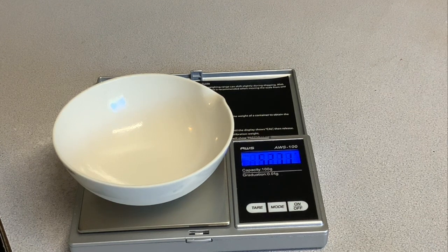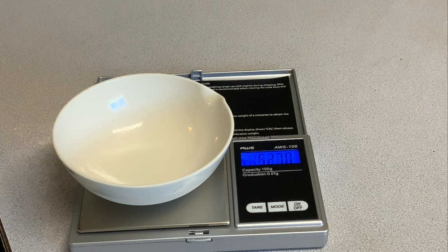In this case, for my experiment, it was 52.71 grams. And that was the mass of the evaporating dish empty on the first trial.